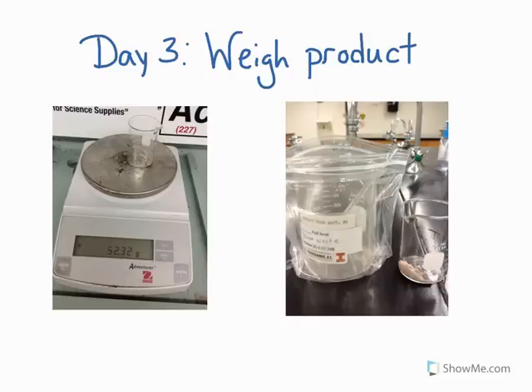The third and final day of this experiment, what you'll do is you'll take the beaker that's been in the oven overnight and your solid, which will be in there, that should be dry, that's your solid silver, and measure and record the final mass of the beaker plus the silver solid. Then dispose of the silver solid into the beaker that is provided by your teacher for waste. That's it. That's our 3-day experiment of making silver.